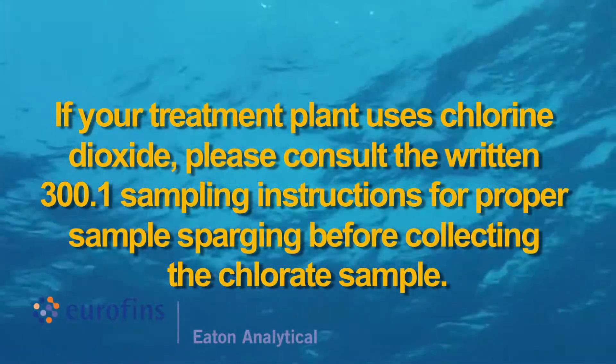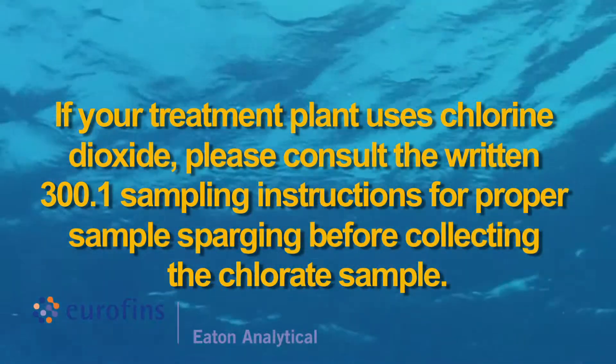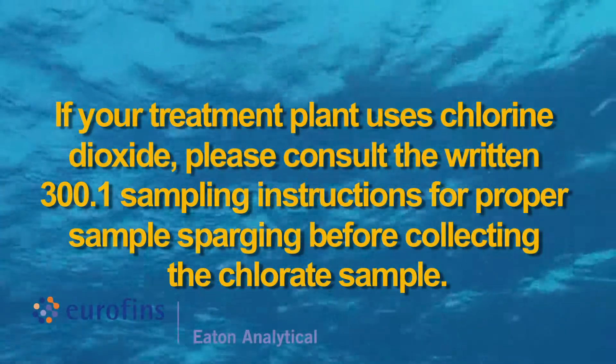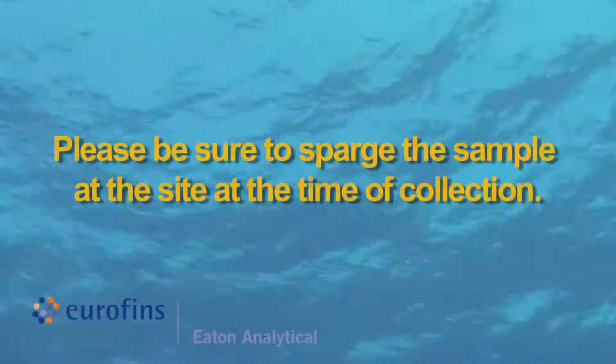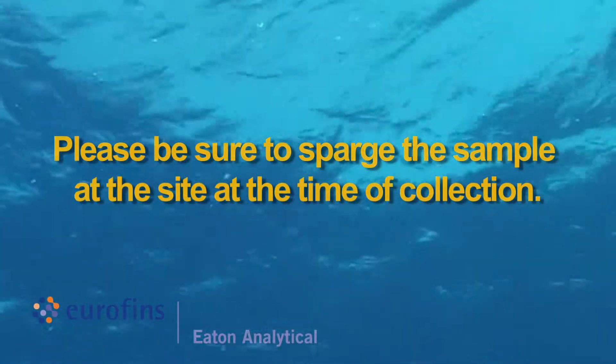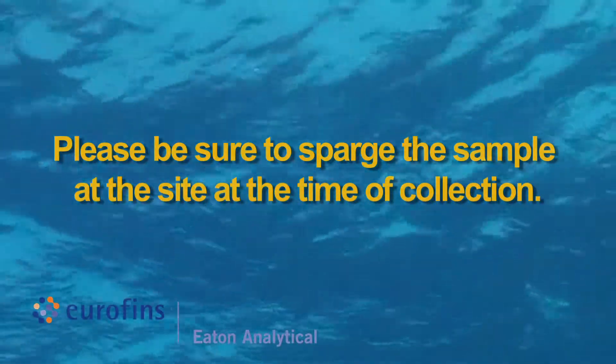If your treatment plant uses chlorine dioxide, please consult the written 300.1 sampling instructions for proper sample sparging before collecting the chlorate sample. Please be sure to sparge the sample at the site at the time of collection.